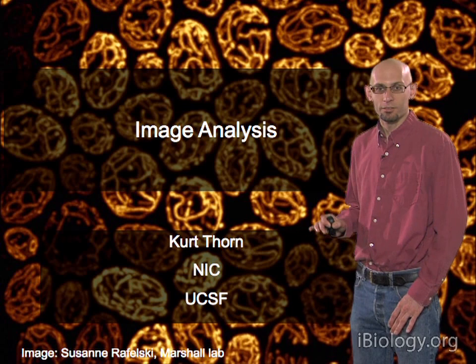And so if you put these both together, this is how you would do that analysis. You measure some image here, that's this IMES, and it's equal to your true image in the absence of these problems, the true image times the shading correction. So your true image is multiplied by whatever this non-uniformity is, and then you add to that this dark image. And so just doing some algebra, you can get out that your true image is equal to your measured image minus the dark image divided by the shading image.